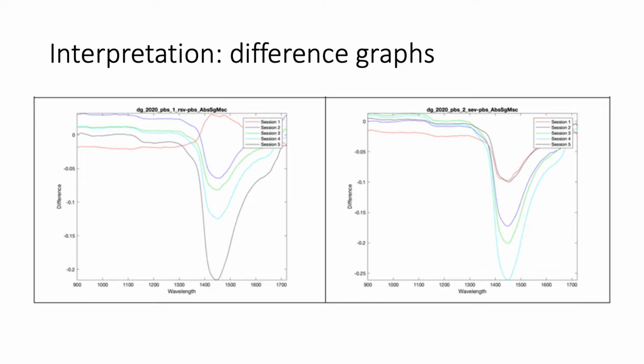That is the current focus of the project. Future work will include the following: interpretation of their NIR spectral differences, which enable their detection, and testing the analytical protocol on different viruses, including rhinovirus, influenza virus, and SARS-CoV-2 virus.